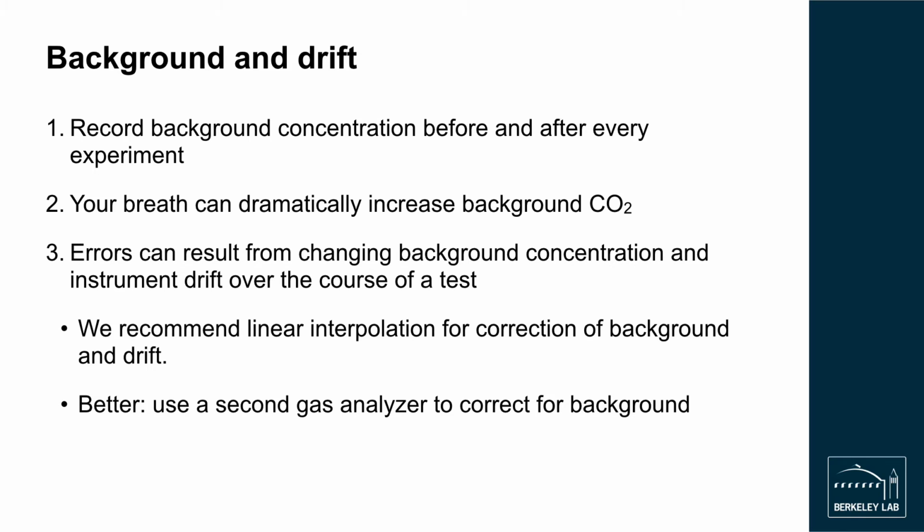The ISO protocols require that background concentrations be measured before and after every experiment. We recommend that a linear interpolation of the pre- and post-test ambient concentrations be subtracted from real-time concentrations measured by the gas analyzer. Alternatively, a better approach is to continuously monitor background concentrations with a second gas analyzer and correct the measured duct data accordingly.